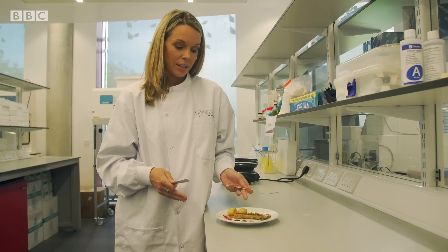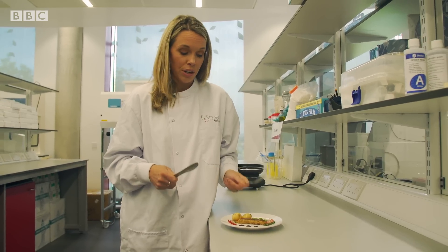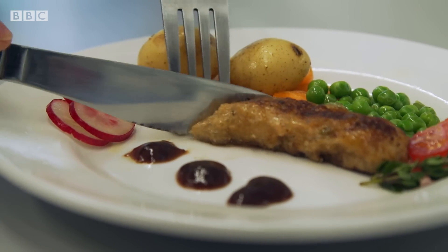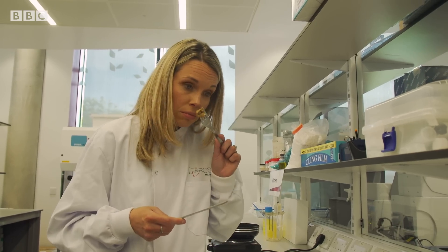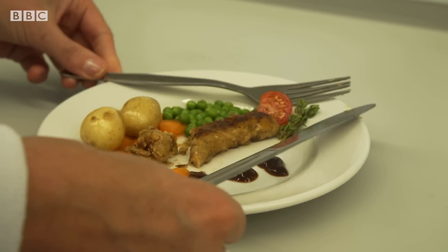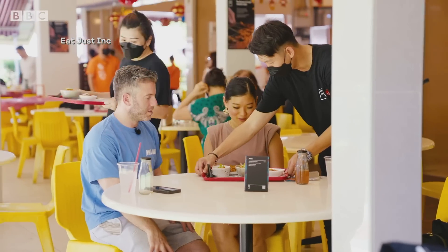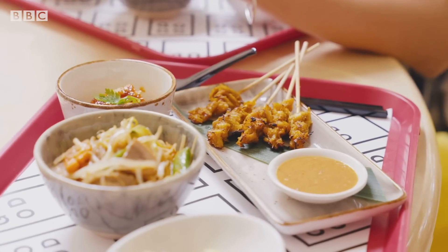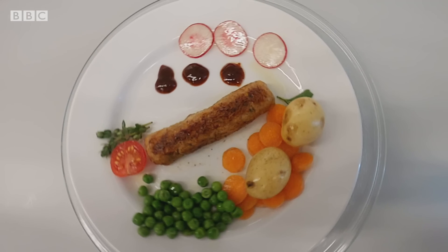So there we have it — the finished product. We aren't able to taste this sausage because it doesn't yet have regulatory approval here in the UK, but we're going to cut it open and have a little sniff. Texture-wise, it looks like a sausage. And it smells like a sausage — smells like chicken. Singapore approved lab-grown chicken meat for consumption two years ago, but here in the UK approval is still some years off. Roslyn Tech say they don't believe cultivated meat will altogether replace traditional meat production, but rather that there'll be room at the table for both.